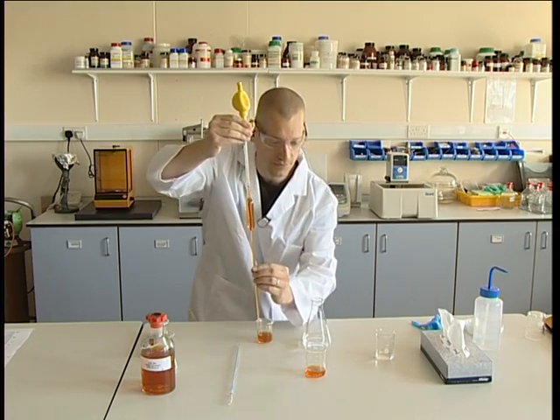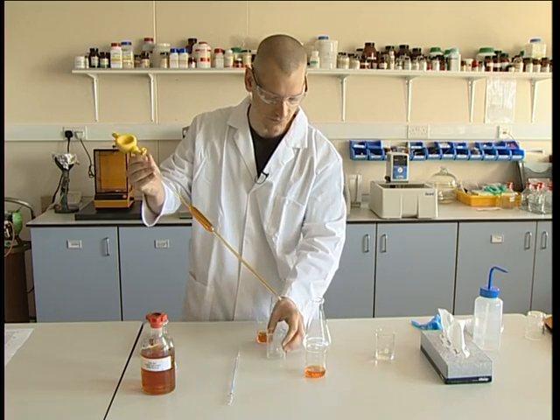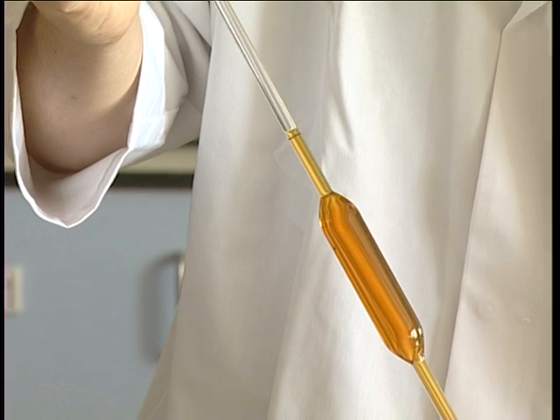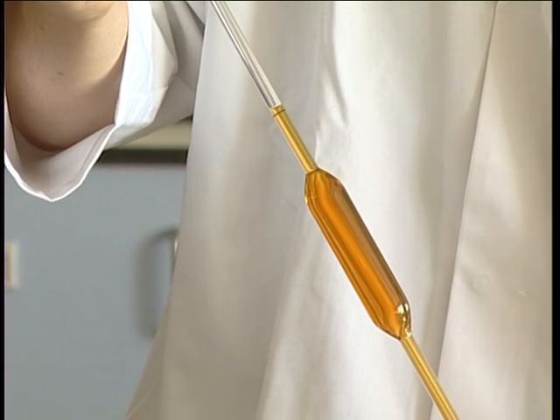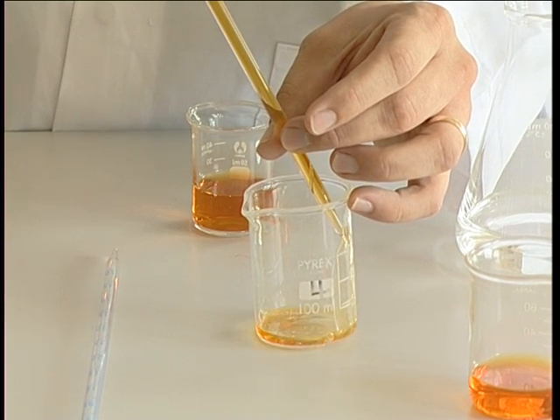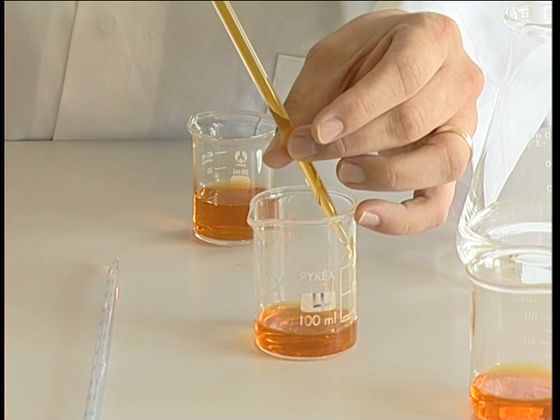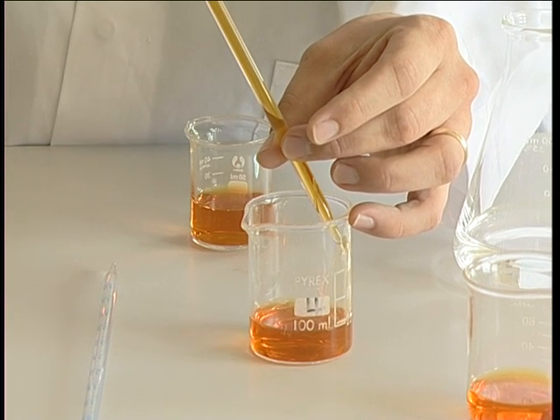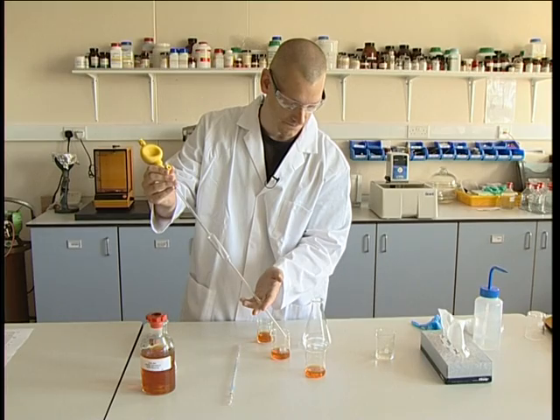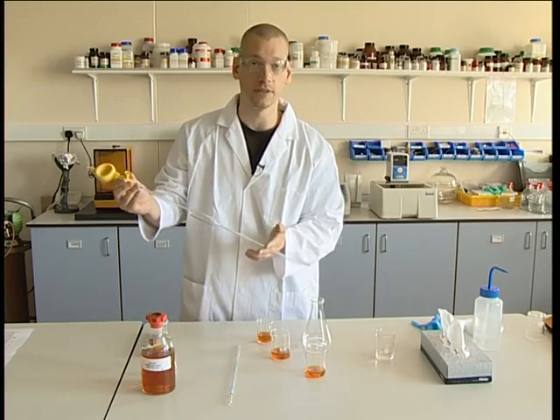Once we have that at the graduated line, we can then dispel the volume of liquid into our desired vessel. When dispensing the liquid, just ensure that the pipette is at 30 degrees to the flask wall — the pipette end must touch the glass wall — and then we can just dispense the liquid. And with one final tap, 25ml has been accurately transferred.